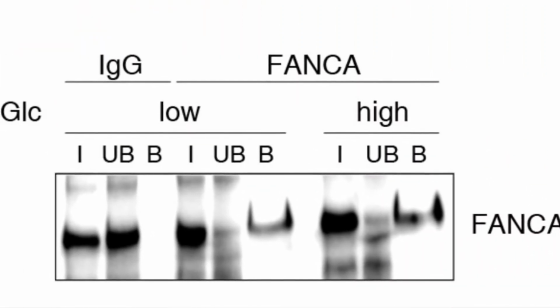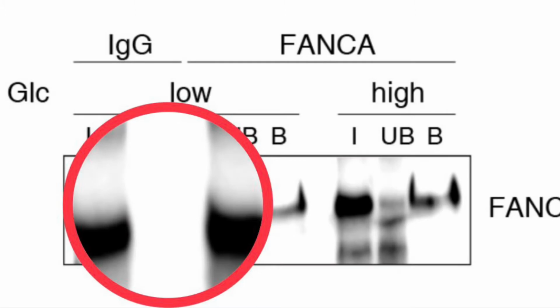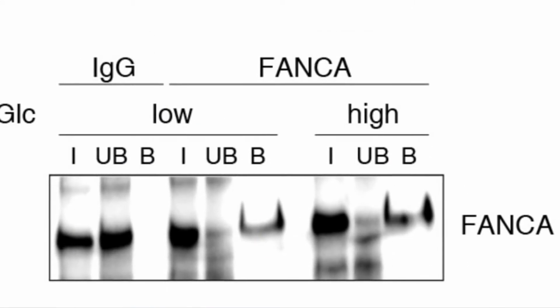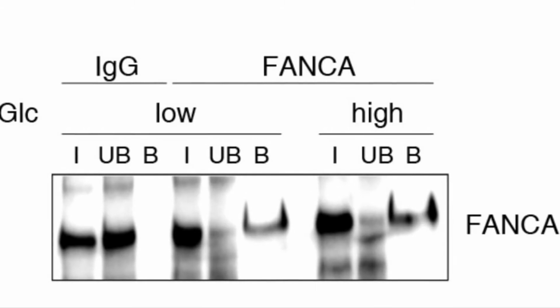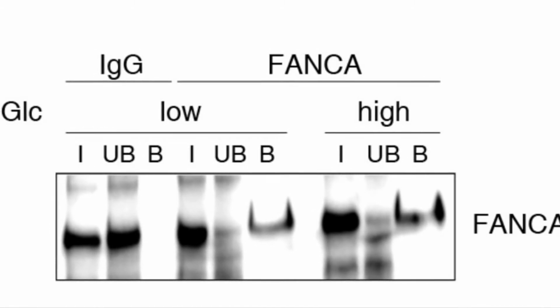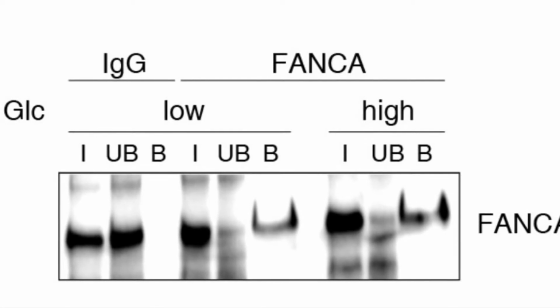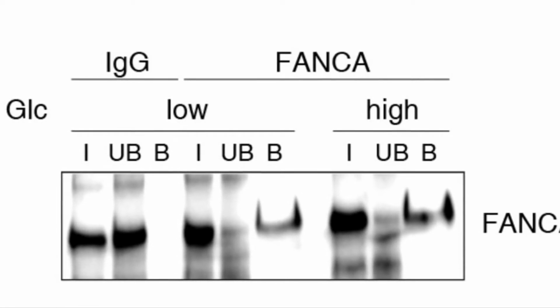So let's see here how that exactly looks on the Western blot. Pay attention. My IgG is completely blank, so that's a good sign. My friendly suggestion to you would be, when you're doing a Western blot experiment to confirm that your co-IP works, have an input, unbound and bound fractions all together. That way you can easily troubleshoot if something doesn't make sense later, and you can always come back and see how your Western blot looked.